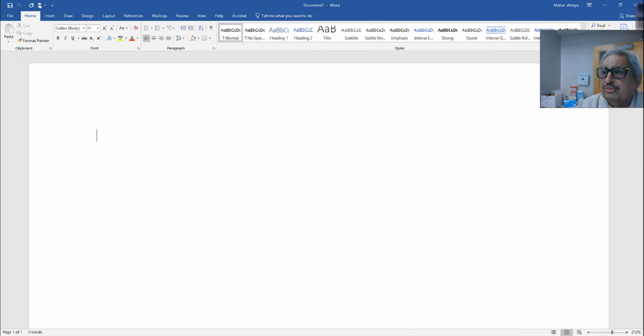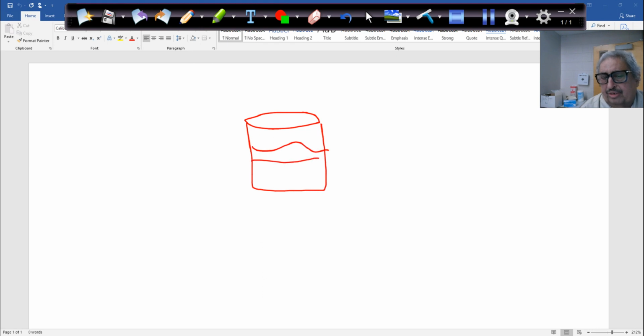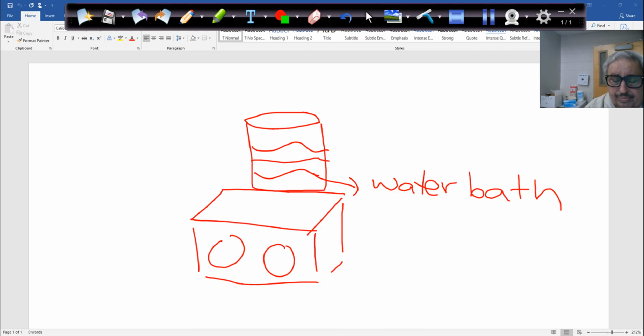So what we have to do in this experiment here, you take a 400 mL large beaker, about 3/4 full, more than half, or maybe 3/4 will be good. So this is the water bath. Then you put this one here on the hot plate. That's the dial of the heat, the temperature dial. Don't worry about that, that's the stirrer.